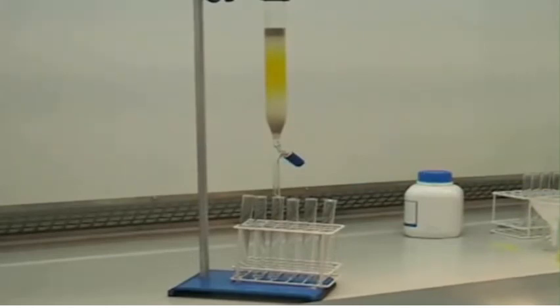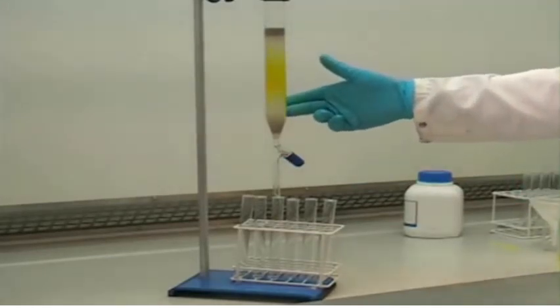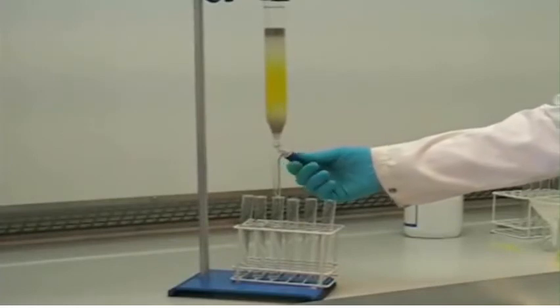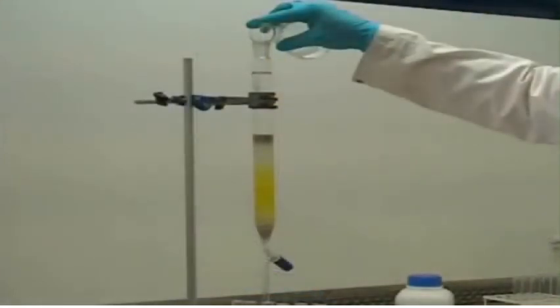Because our compound is coloured in this case, we can actually see it moving down the silica. This will give us a good indication as to when it's actually eluting from the column. In cases where you can't see the compound because of any colour, you can use TLC to analyse the fractions to identify the presence of different compounds. And as the level of the eluent approaches the sand, it's important to make sure that you top it up.